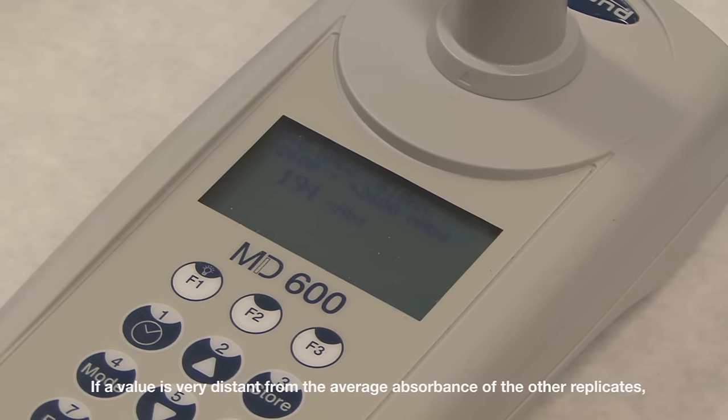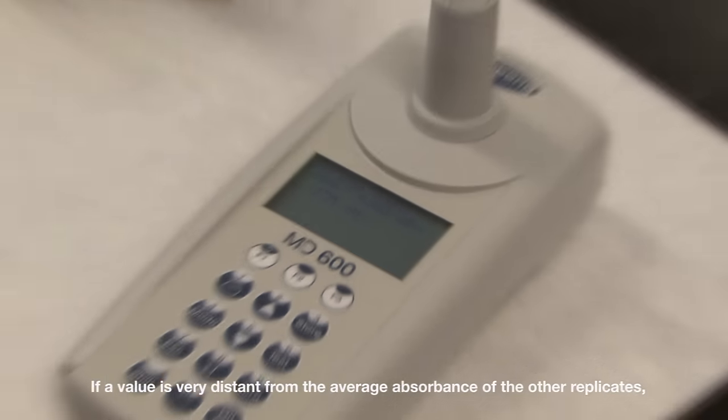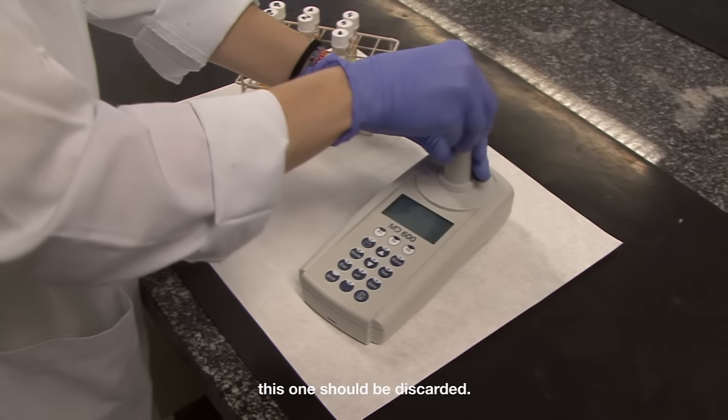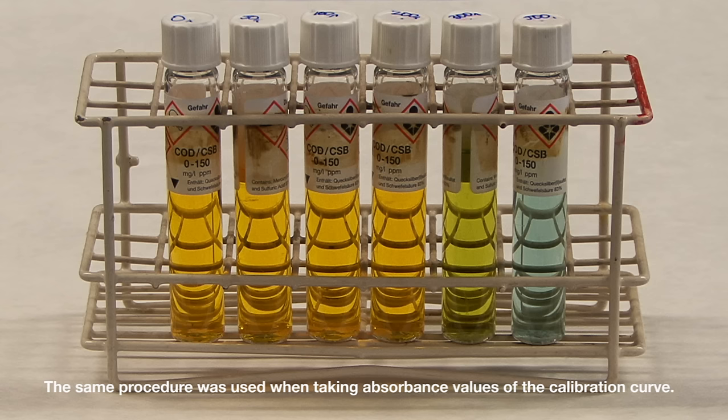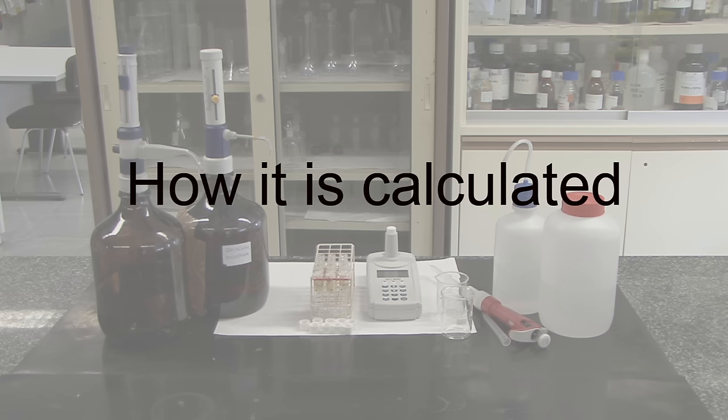If a value is very distant from the average absorbance of the other replicates, this one should be discarded. The same procedure was used when taking absorbance values of the calibration curve.